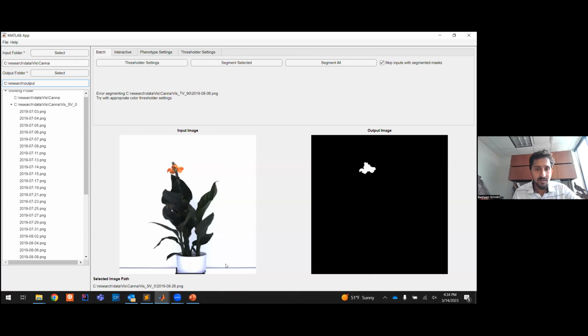Is there any question till now? Okay, there's one question here. For plant area, does the total plant matter containing pixels get converted to real area?